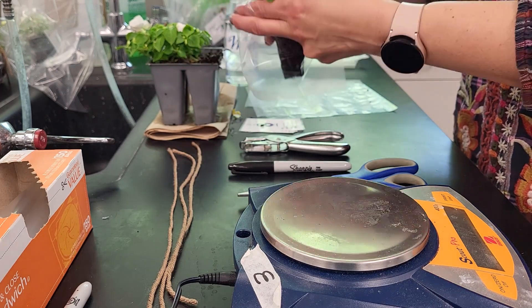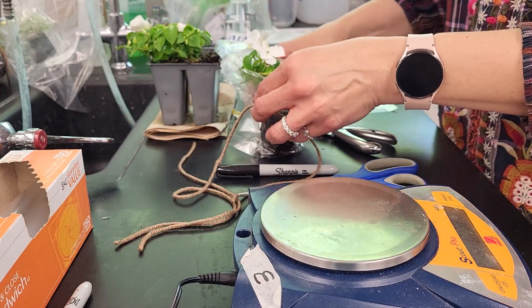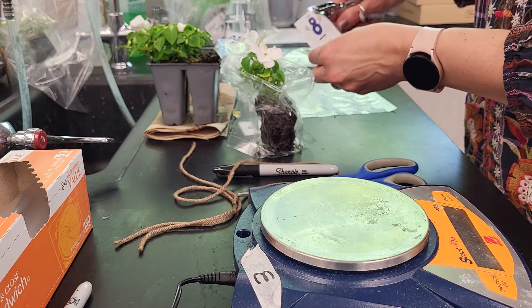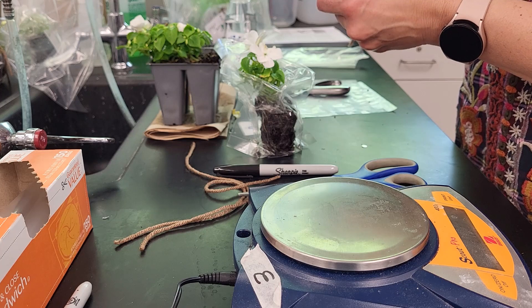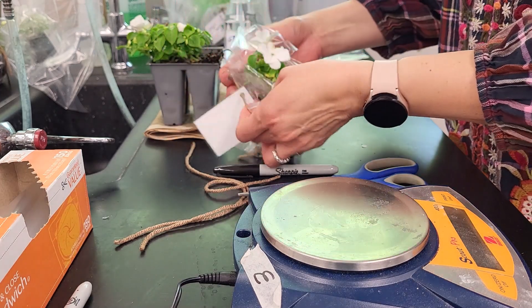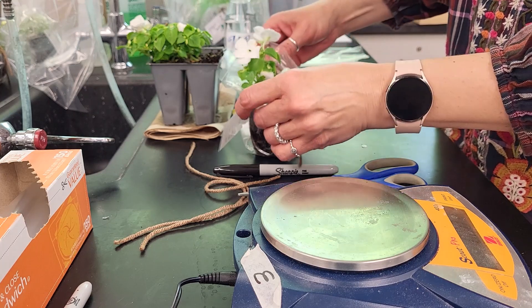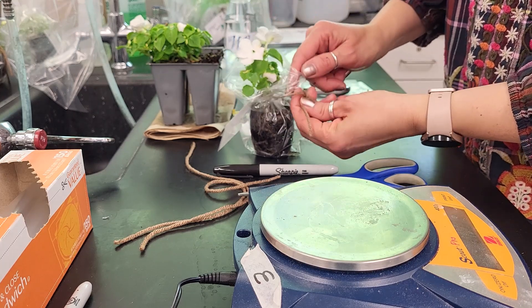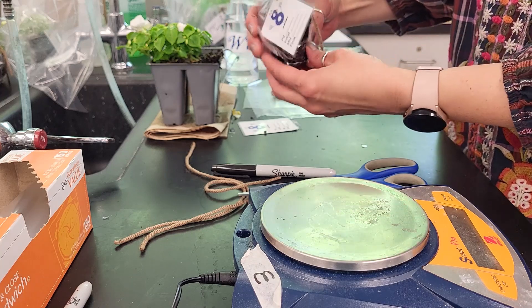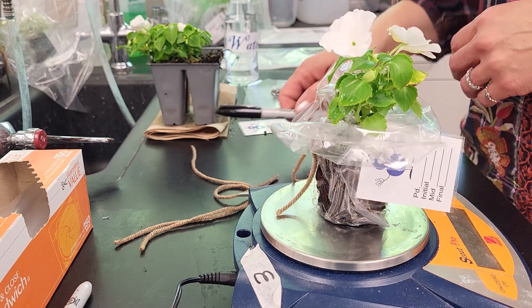We're going to put the whole root ball into our plastic bag. Sometimes it helps to squish it down so it stands upright. We're going to tie the bag around the root ball and label it with tags so that we know the initial mass and the mass as we go for each time we record data. Over the next three class periods we're going to measure how much the whole plant weighs. Tying it off at the base of the plant ensures the entire root ball is enclosed in plastic, so the only way water can escape is through transpiration. We'll record the mass of each plant and write that on the label.